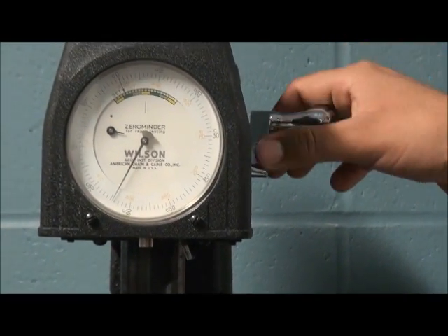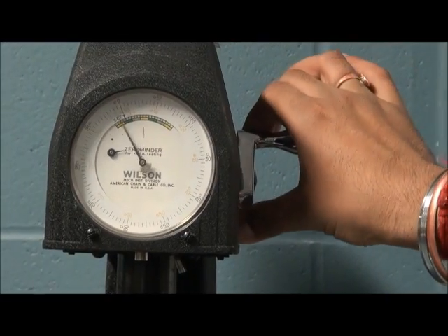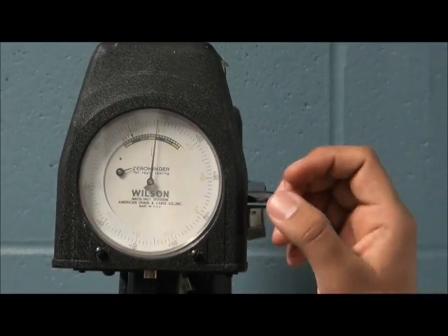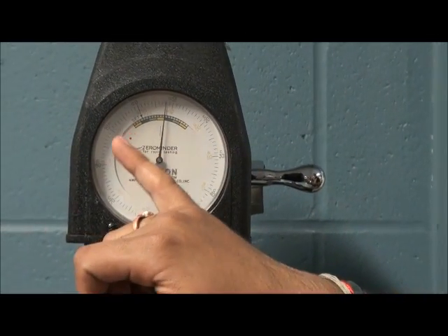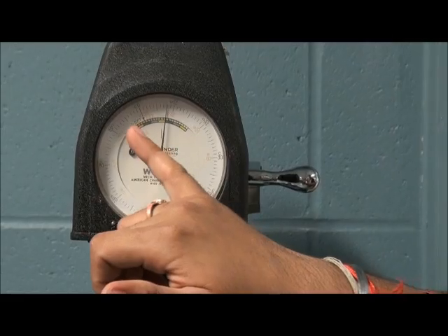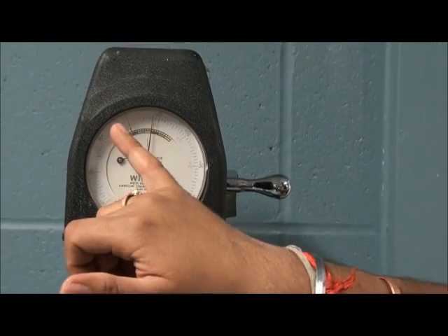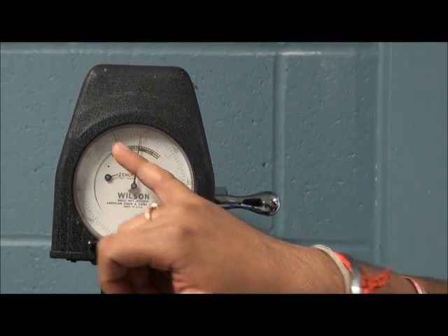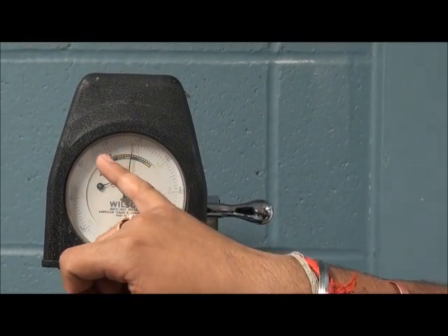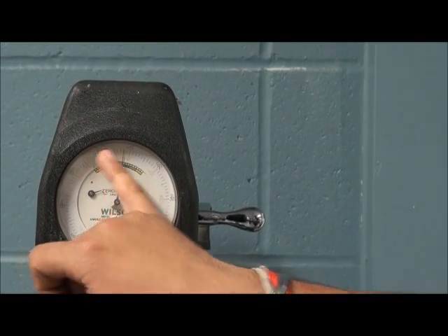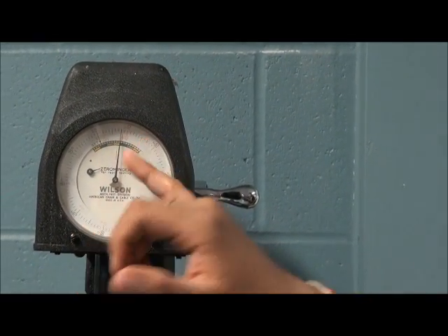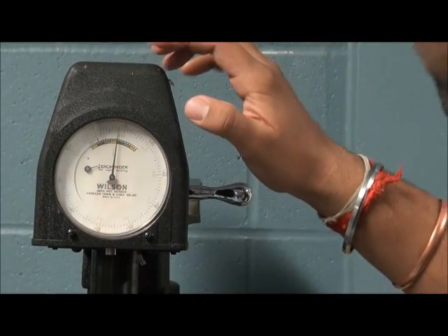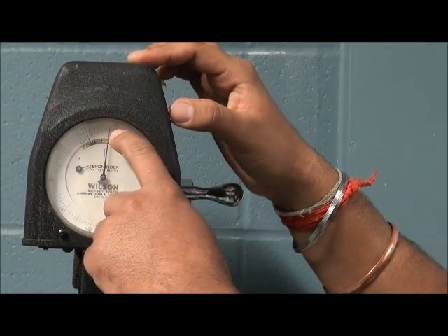Our next step is to release the major load. Now we can see that if the bigger pointer drops to this point from this cycle the material is softer. Now we can see that the bigger pointer is moved towards the right side, then our material is harder. And the reading of this scale is on the Rockwell hardness scale.